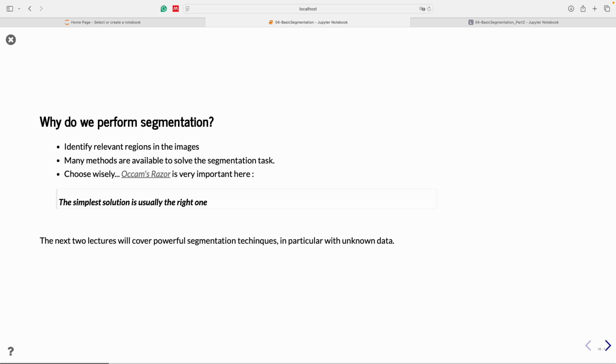So you have to select and be aware that there are very many methods, and also what some of them have as advantages and disadvantages. And actually, this and the next lecture will be about segmentation, because it is a very central topic in the quantitative analysis.